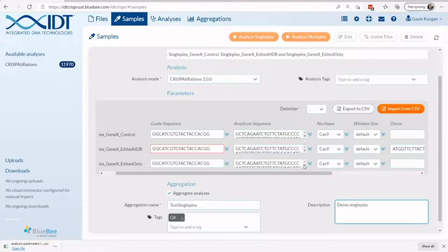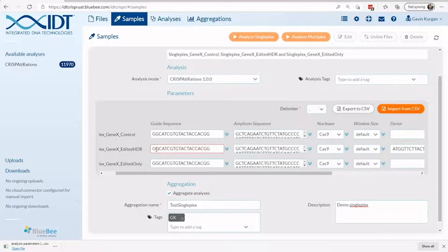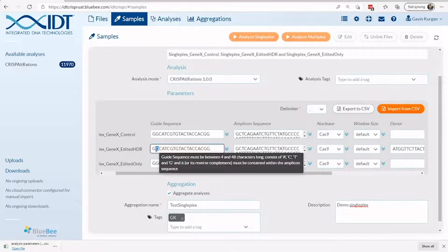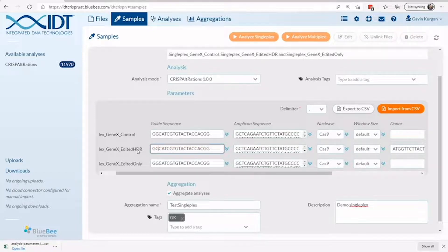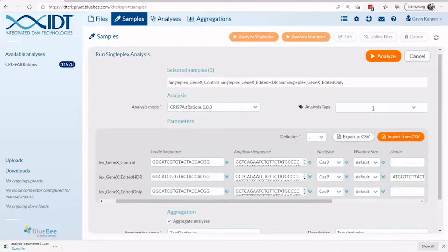In some cases, you may not be able to start a run and the sample information has a red box around it. This sample is failing our QC checks due to a non-nucleotide character. Please check the hover text on a parameter for acceptable inputs and correct accordingly. Once corrected, the red box should disappear and the analysis should be able to be run.